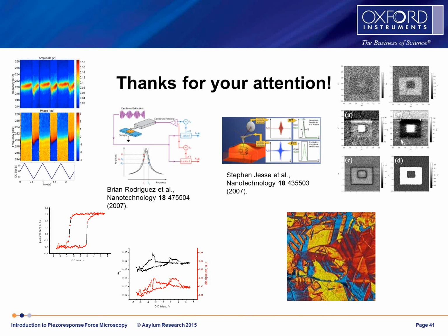Well, first of all, I'd recommend you do travel to his lab in Oak Ridge. I think it's a great place to visit. If you want to do Band Excitation, we will be announcing fairly soon here, or maybe we already have, a partnership with a company called Luke Instruments, where we'll be providing another accessory module that will allow pretty advanced band excitation measurements on Asylum microscopes.